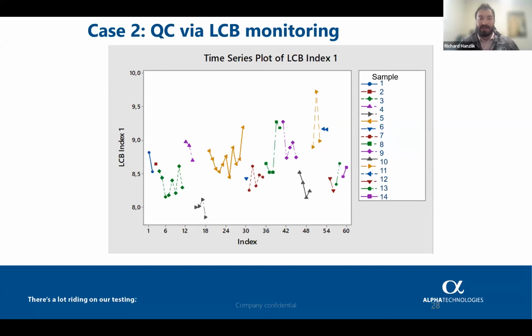So that would be incoming batch validation. So when you get your truckloads of raw materials, you can actually run them right on the RPA with this quick 10-minute LAOS test method, and you can track your LCB content over time. And typically the LCB in the EPDM grades enhances the shear thinning or flow behavior. Therefore, a lower branching content can cause a worsening in the extrusion process.